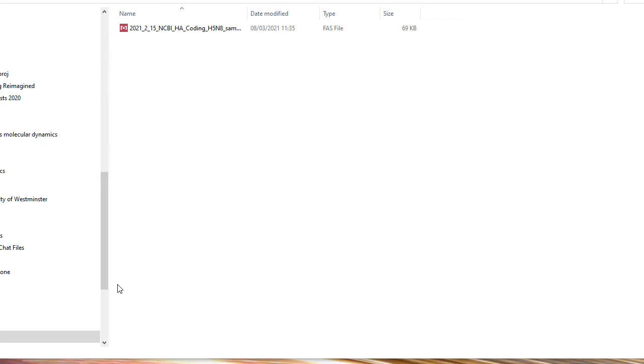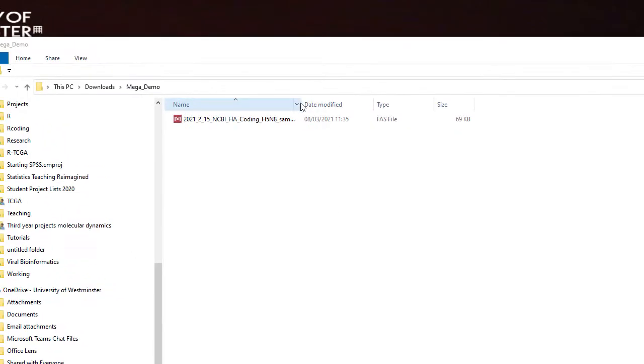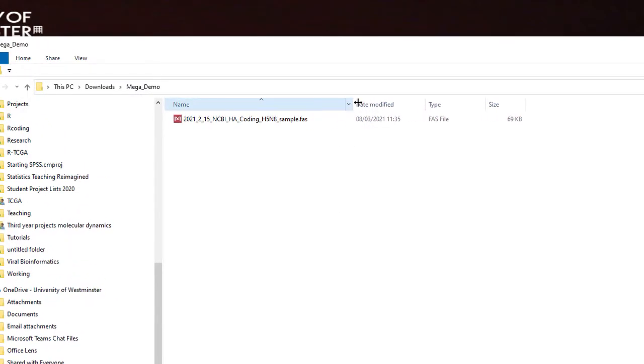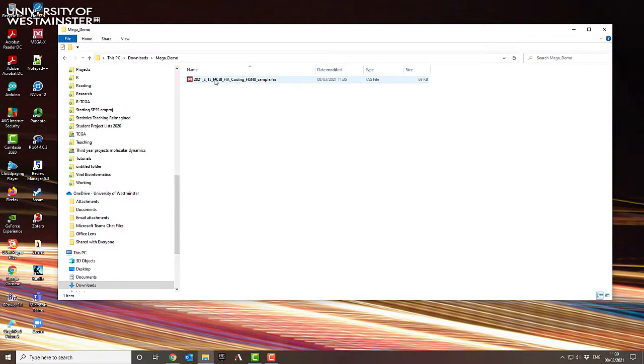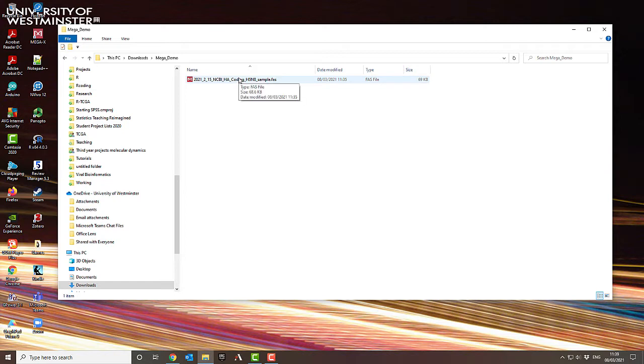I just wanted to create a quick tutorial to show how to use MEGA to do alignment and phylogenetic analysis. So here I've got a FASTA file containing sequences that I've downloaded from a database. In this case it's from the NCBI and these are hemagglutinin sequences from H5N8 and I've taken a sample. So I haven't got all of the sequences because otherwise that would be too large a file and it would take too long to do the demonstration.